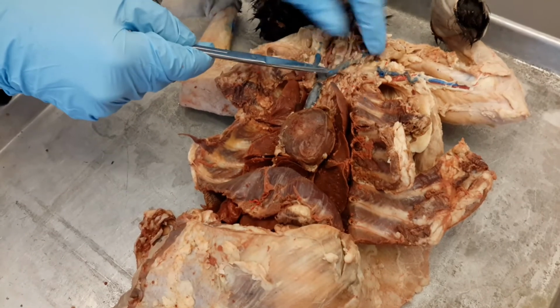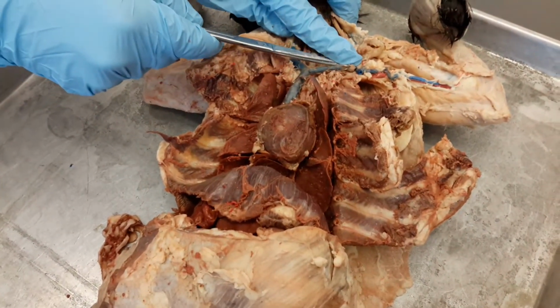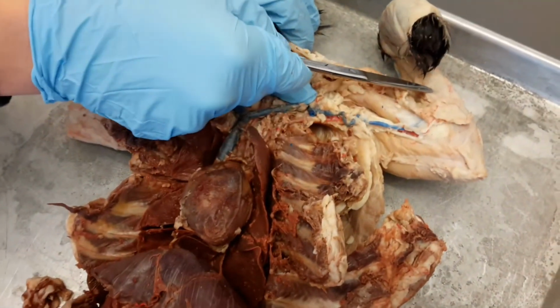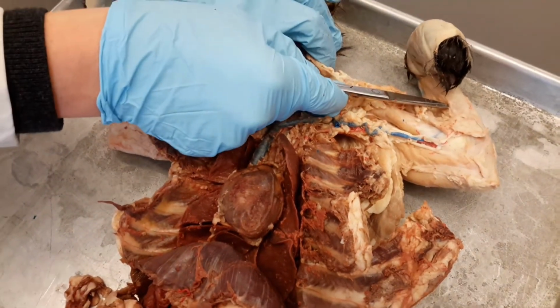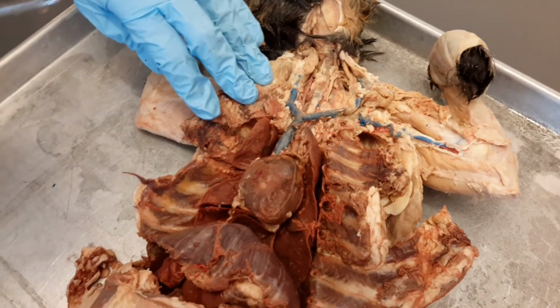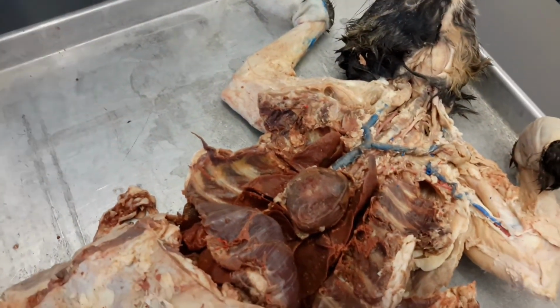So this got a little cut here, but it would be brachiocephalic, subclavian, axillary, brachial. And then ulnar and radial, don't worry about on the cat because they don't have a pinky, so it's hard for you to know which is the pinky side. So they're really just marked by the region. Sometimes it's marked by a vessel branching off.